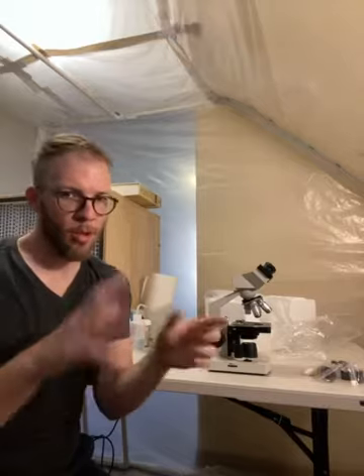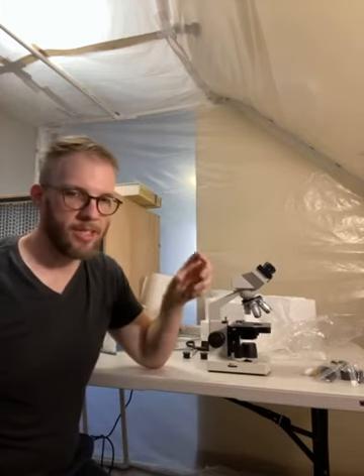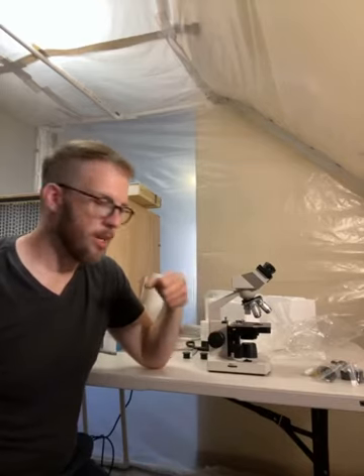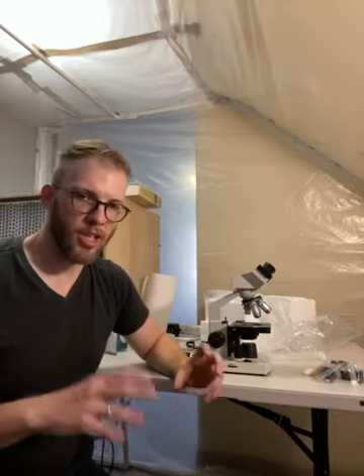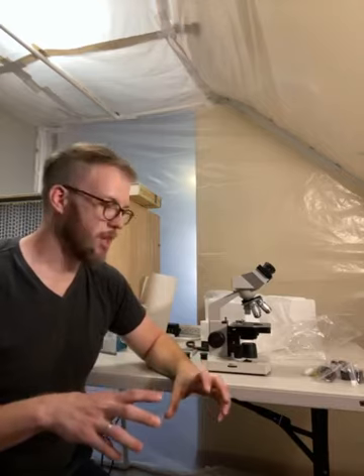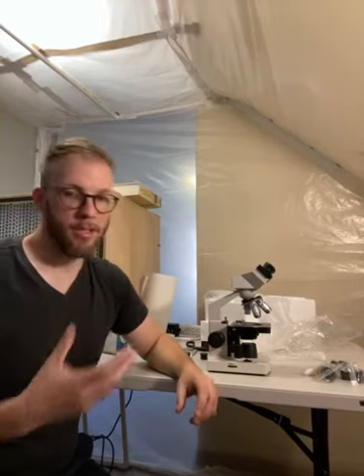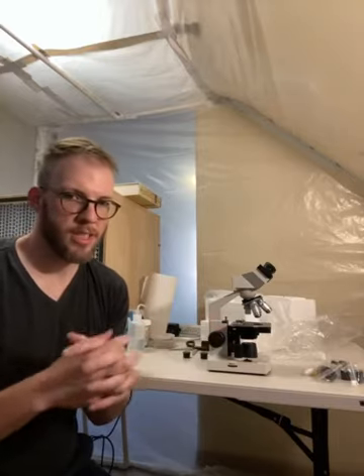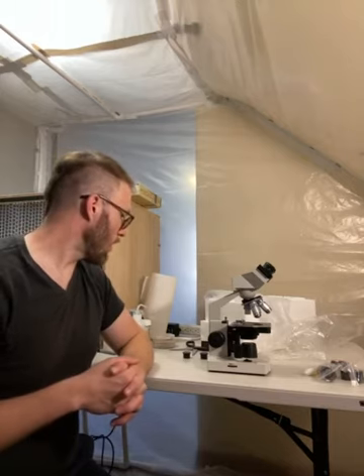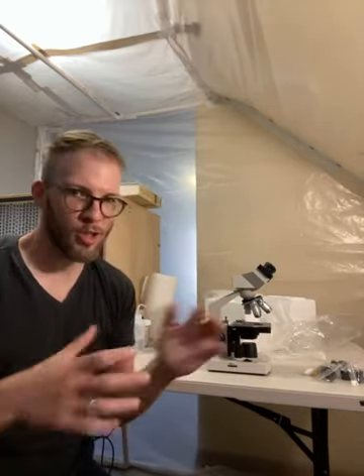In fungal microscopy, measuring individual components is really important for identifying morphology, so I'll need a stage micrometer. There are also digital ways to measure and annotate images. The plan is to first master mounting fungus on a slide and capturing clear images of key structures, then measure and annotate pictures with software, and publish to Mushroom Observer so the broader mycology community can help confirm the species. I'm super excited to try this microscope out.